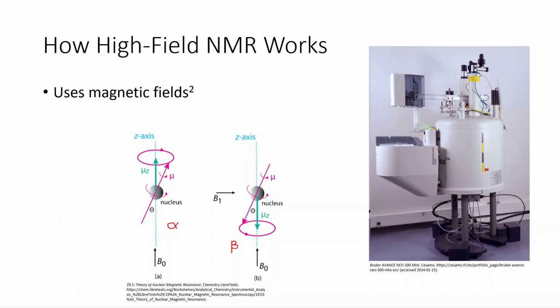Conventional NMR is high-field NMR, where the field refers to the magnetic field the instrument generates. There is high field, medium field, low field, and many more in-betweens before reaching zero-field NMR.